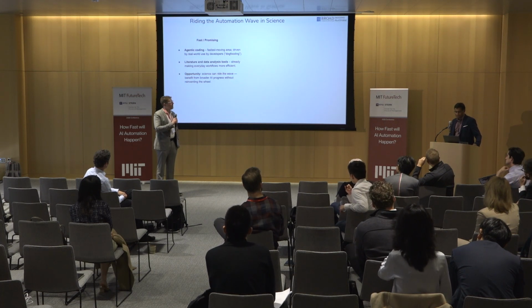Yeah, so I would say that we're a bit of an outlier in the sense that our entire work is predicated on computer vision. The idea that you can identify cells in an image, extract features from them, and featurize it is the basis of our science. So we don't exist without computer vision. It is completely 100% dependent on that progress. To the extent that it's become faster, deep learning technologies have made it much easier to solve some of the problems.